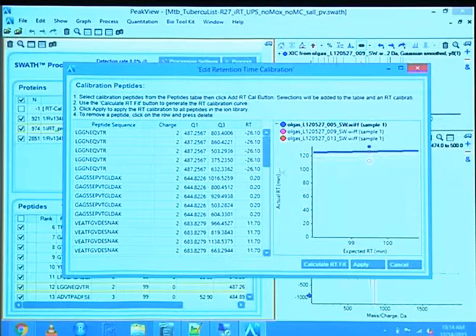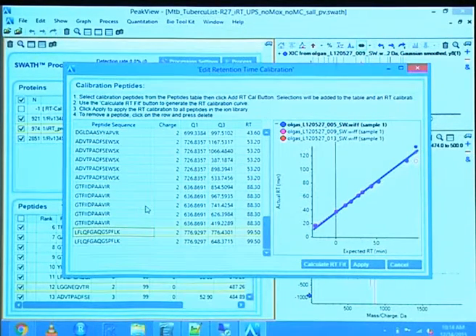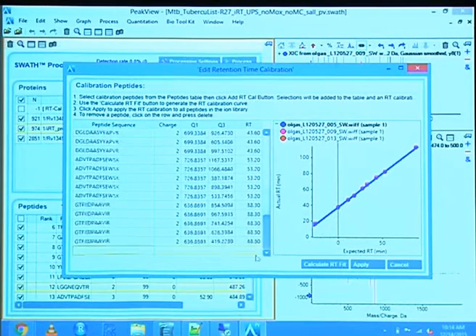What you can do interactively is sort the retention time column from the first to the last. Then you can click that one and just with the delete button, delete them. If I completely deleted it, that one is gone. You see, where is it still? No, it's not there. So now you saw it already corrected the regression, and now it looks much nicer. So that's all it was.